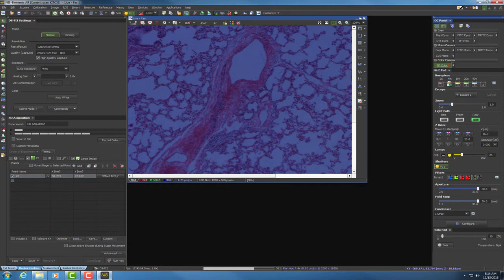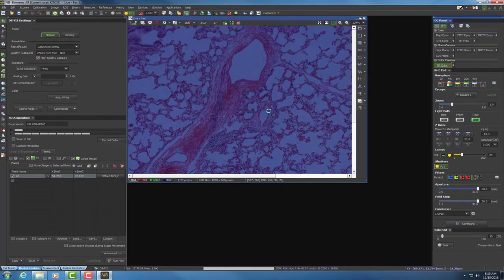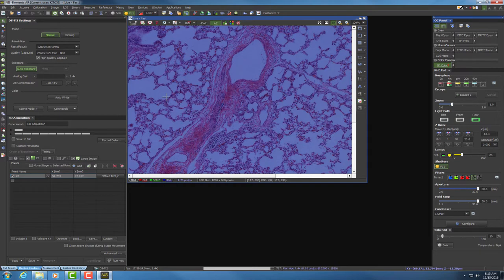Right now we're at 522. If we scroll up we go down to 403, so we're getting out of focus. To get back into focus, use the scroll wheel and move it down — as we do that, our exposure increases up to 829. If we go one more click, it starts to drop to 492, so we go back up one more click to 830. Now we're going to hit auto exposure, which will brighten up our image slightly.